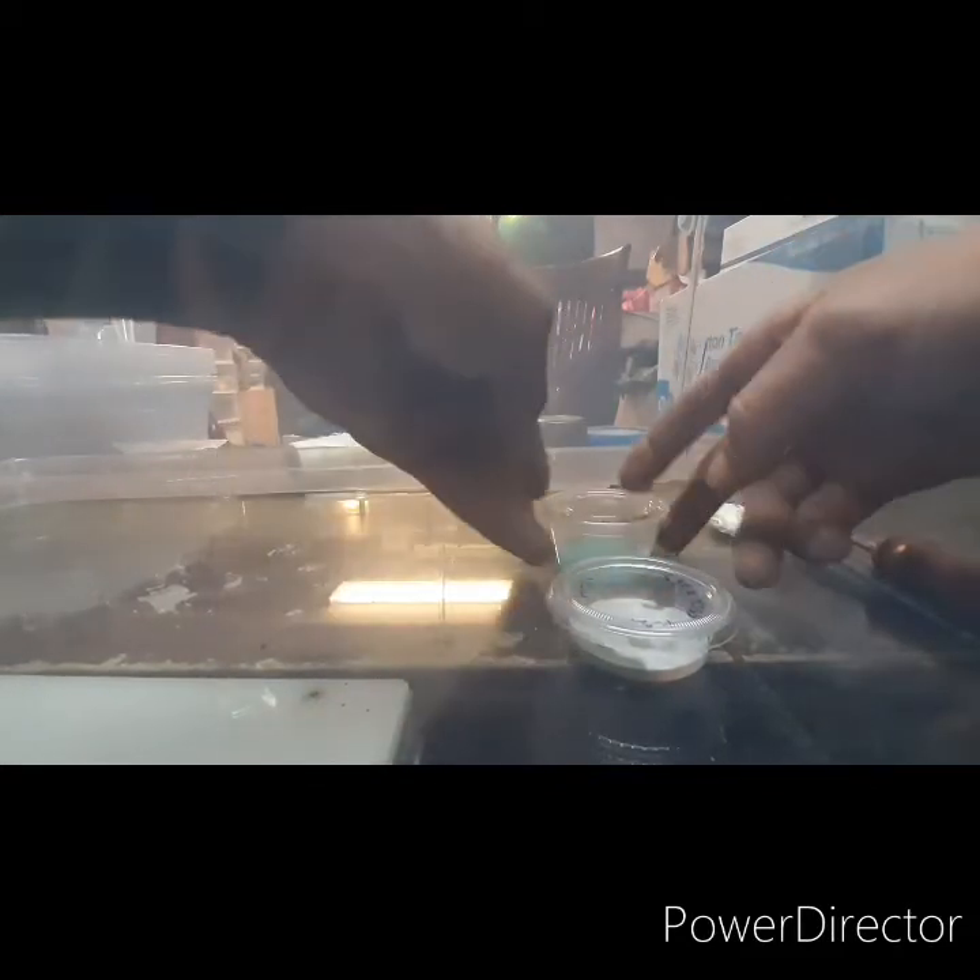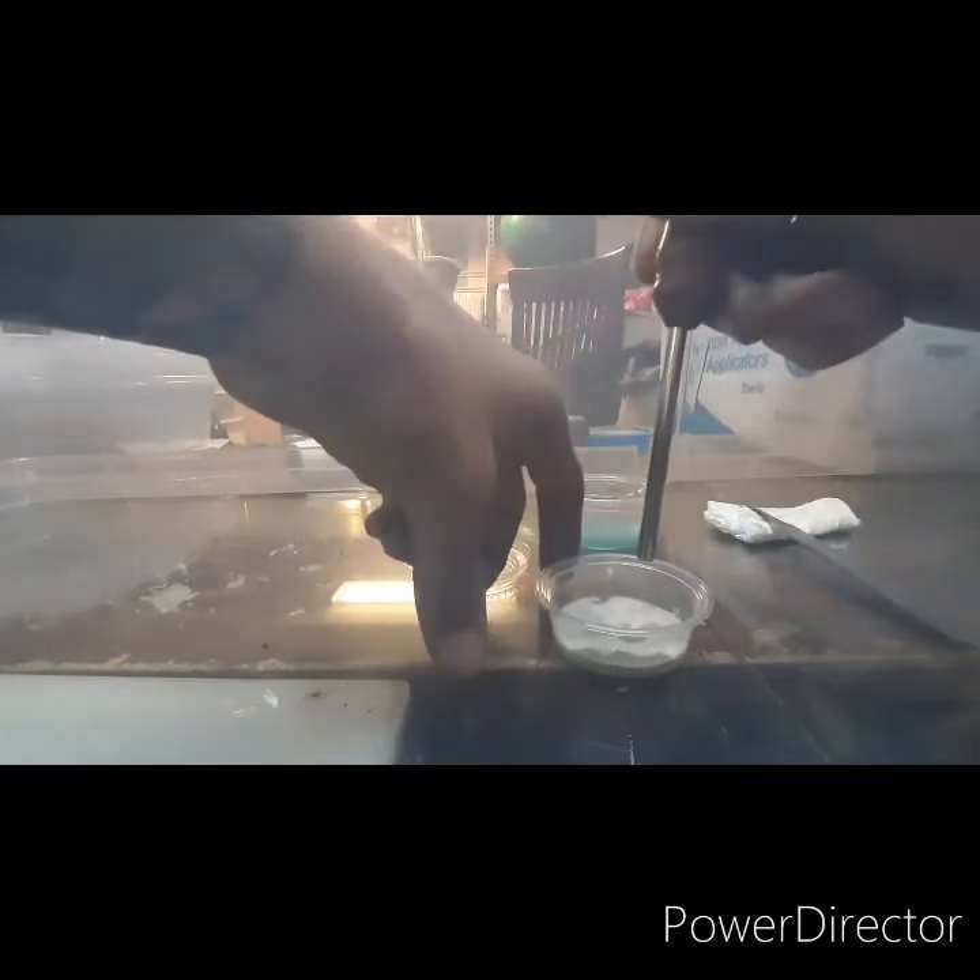If you're in a flow hood you would obviously set it like this. I'm in a SAB, I still set it like this — pop, flip — and I usually hold it at an angle.